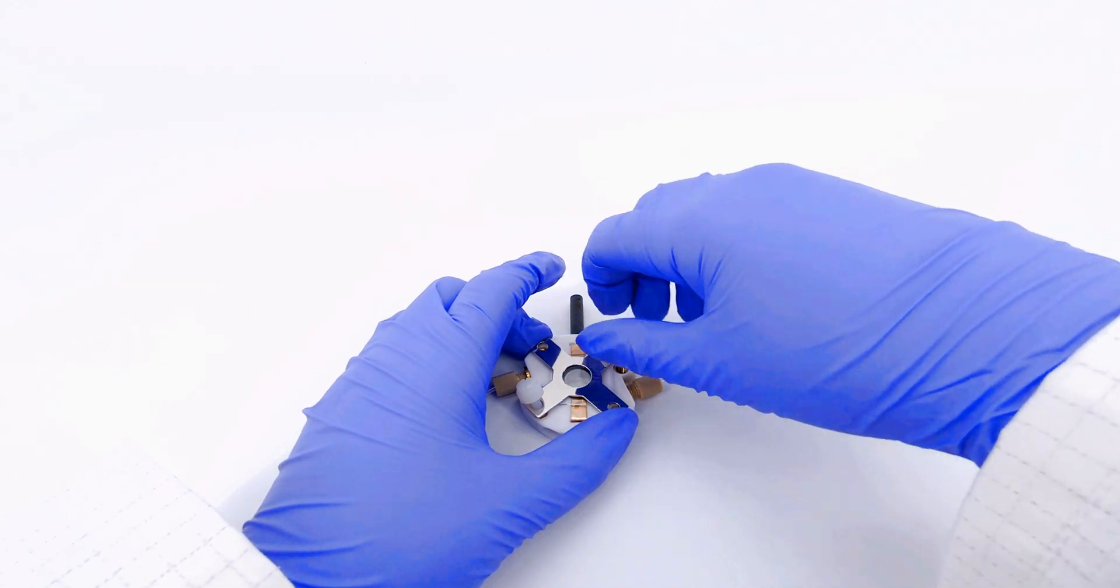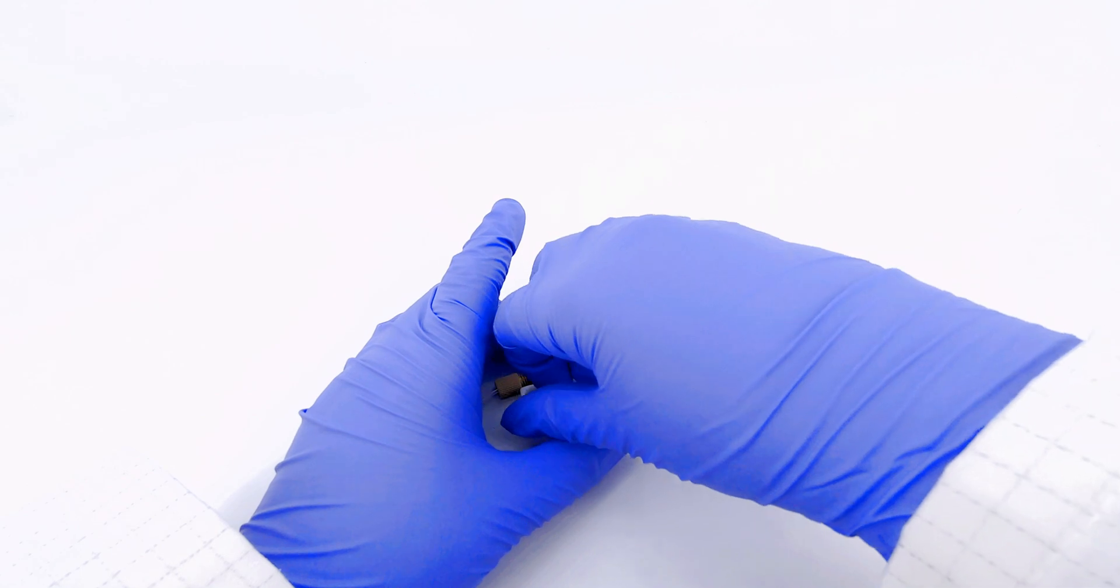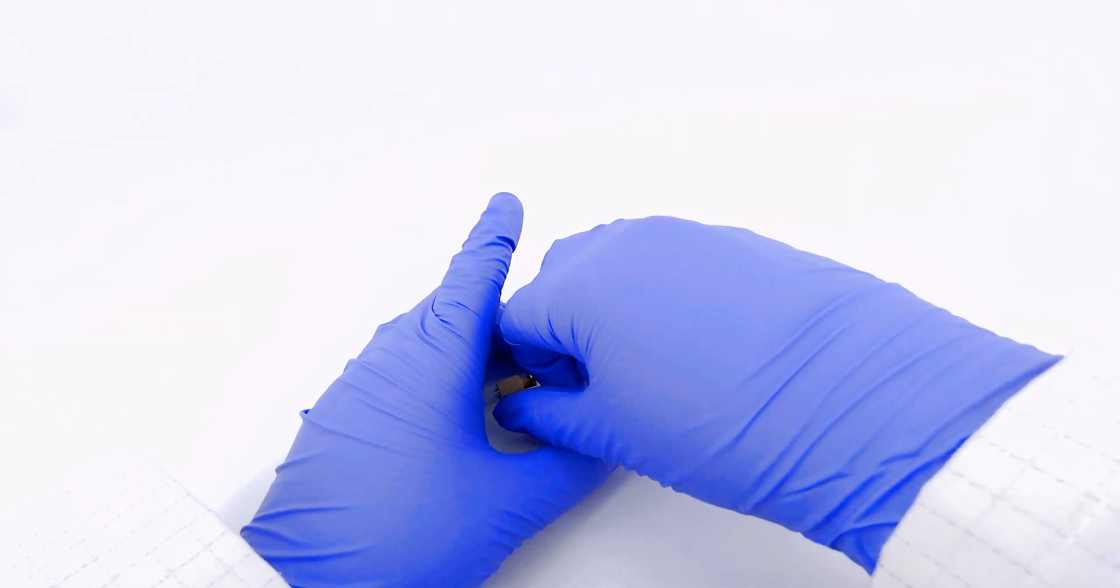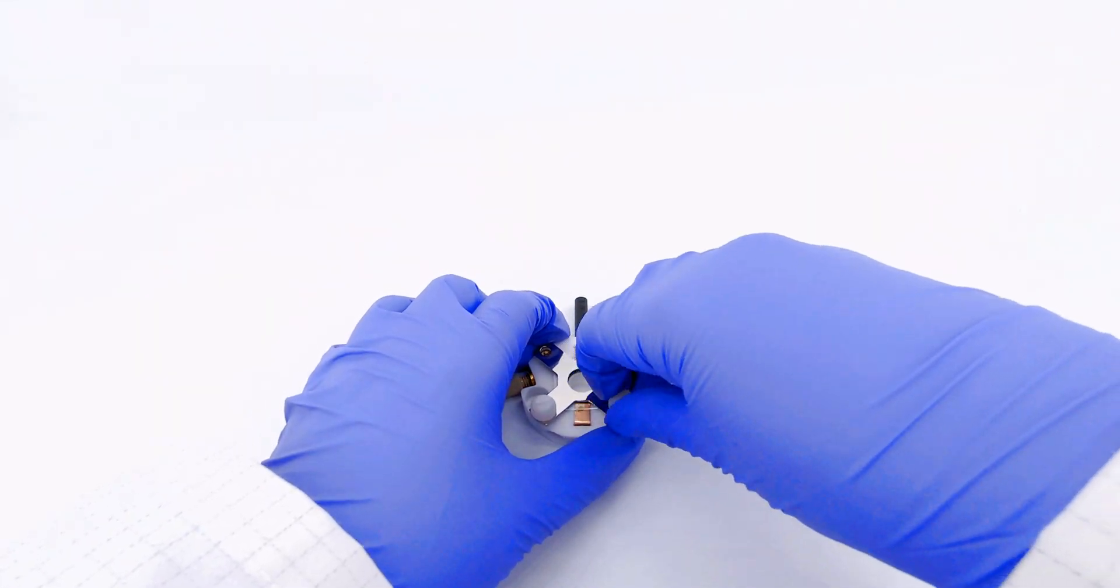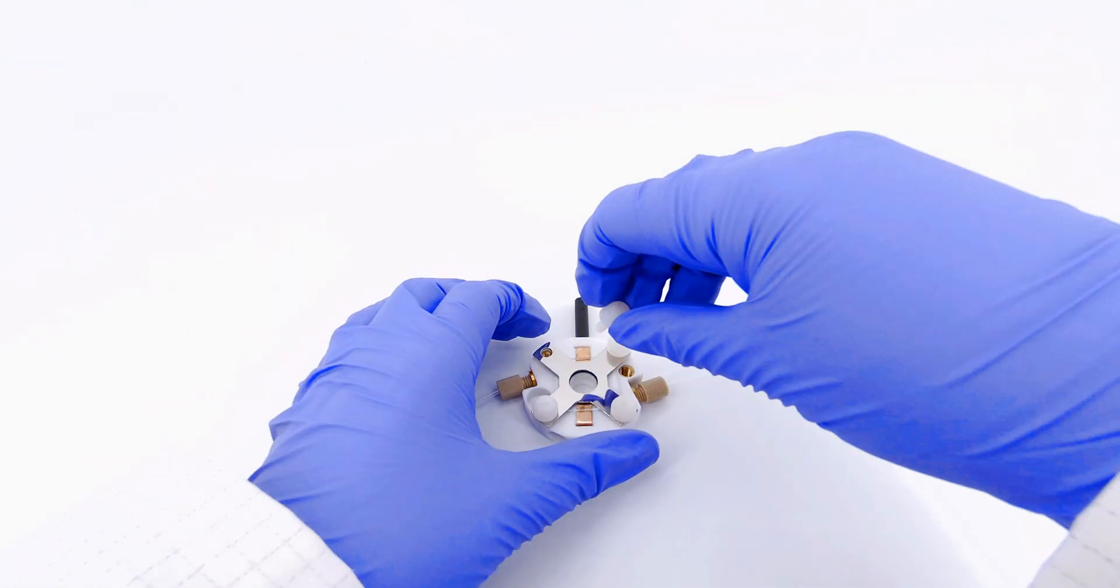Tighten the screws in a star pattern until the substrate is secure and the o-ring has formed a seal. Make sure not to over tighten the screws at this stage as this can result in stripping the brass insets.